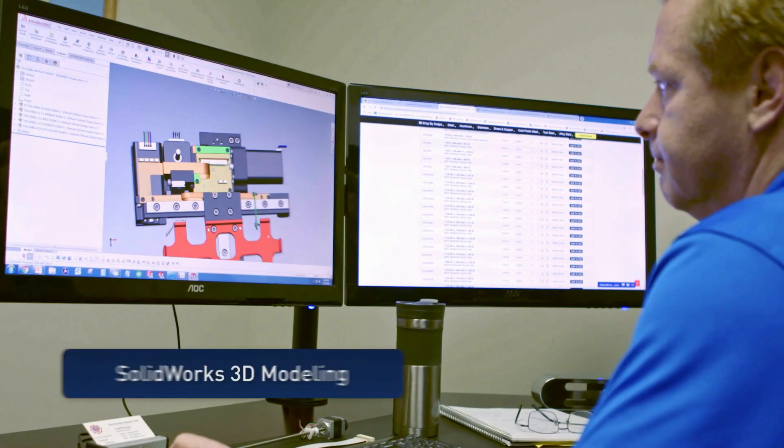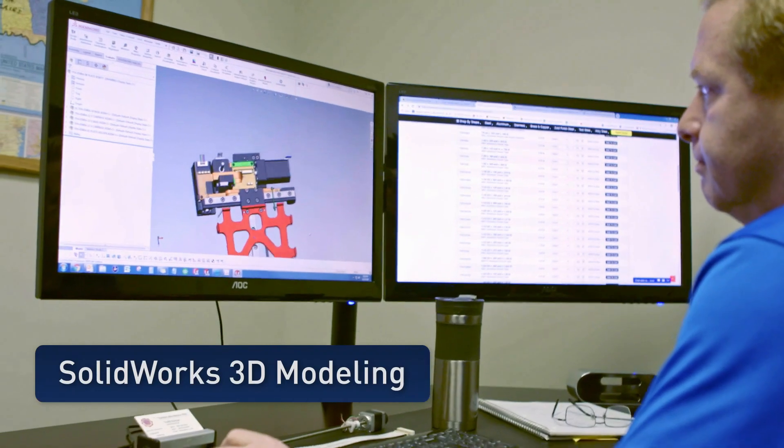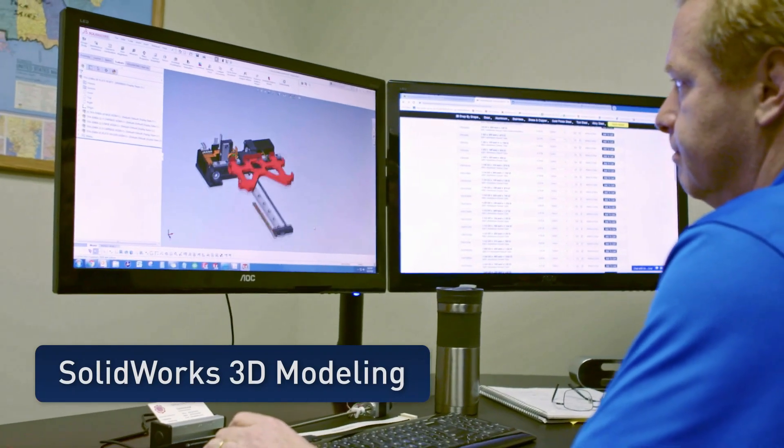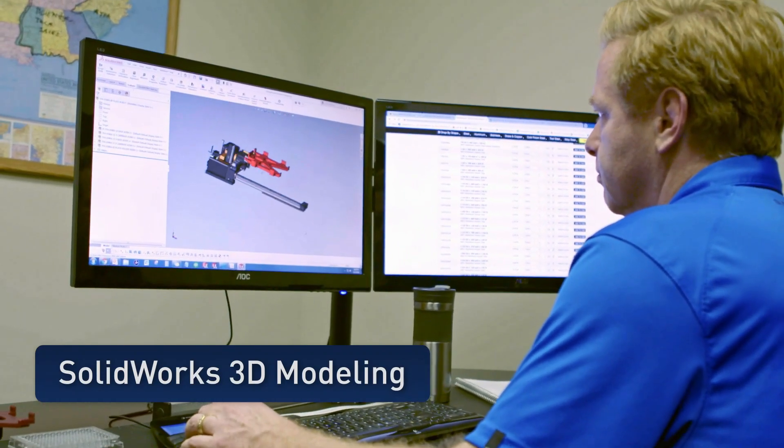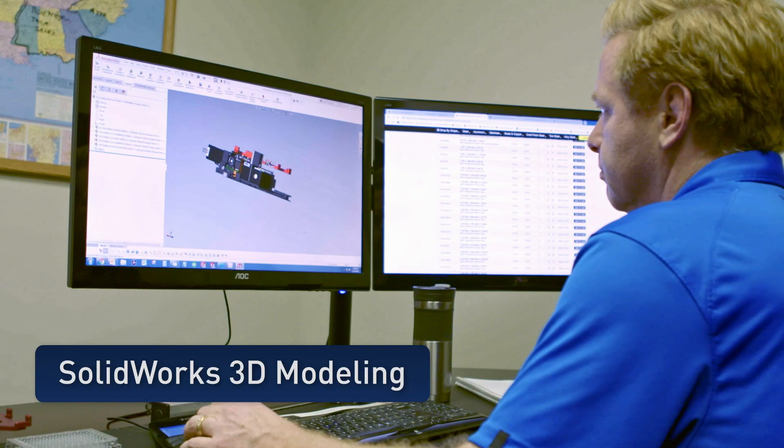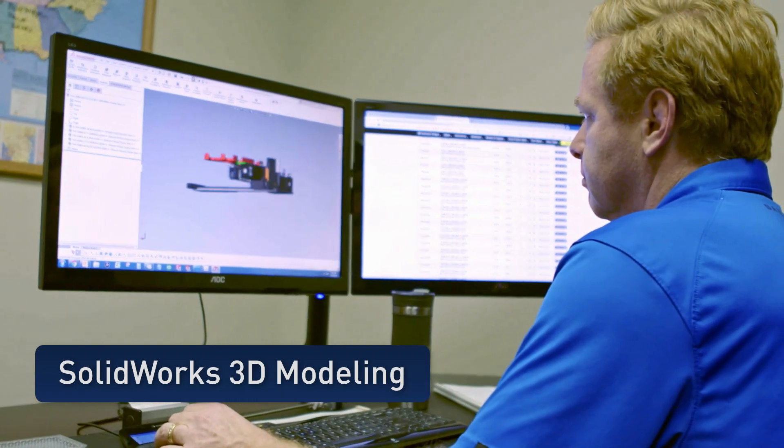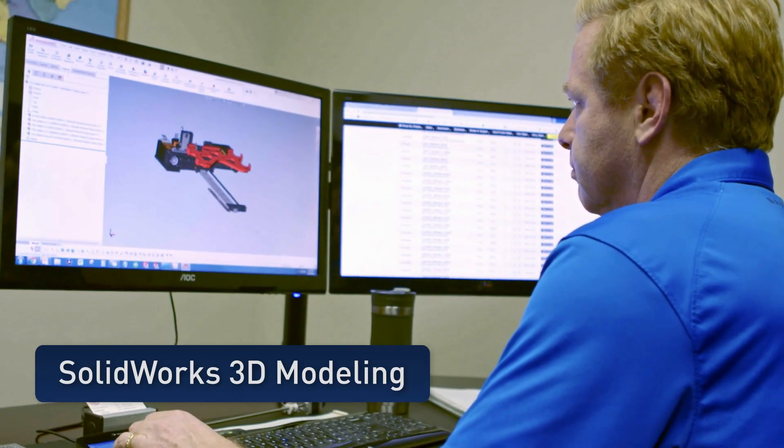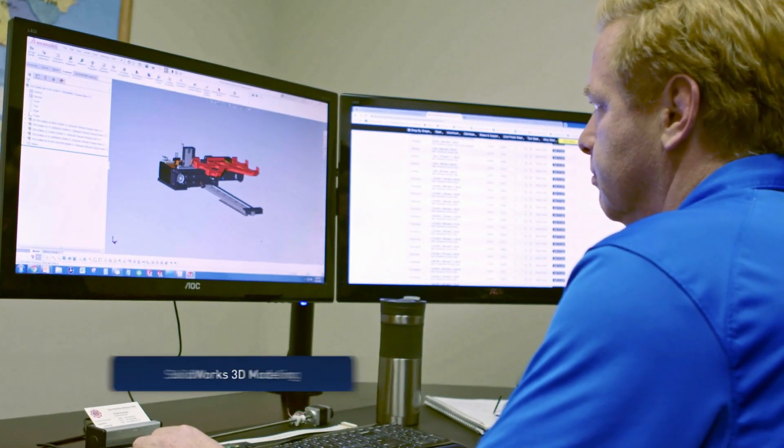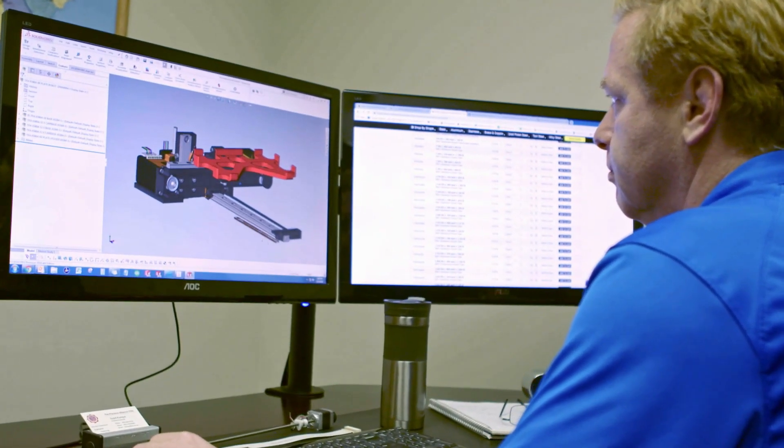It is a pre-engineered motion platform that enables you to focus efforts on the biology, chemistry, or whatever it is that makes your instrument successful and not worry about how you'll move samples around inside your process.